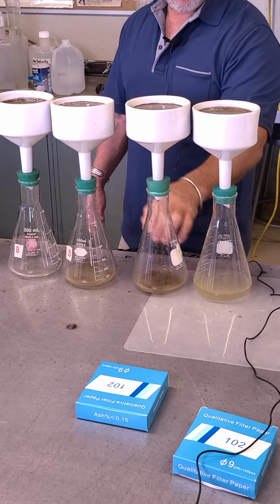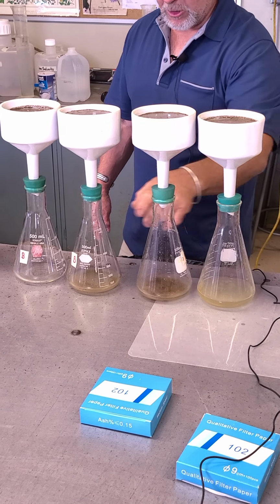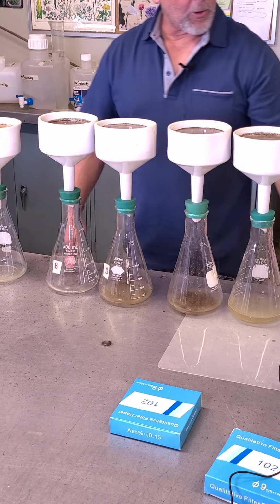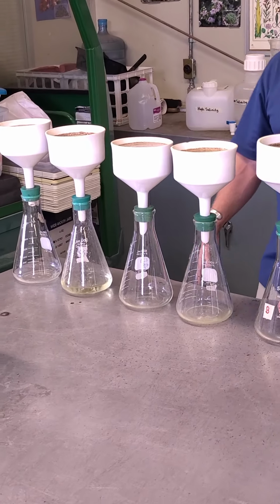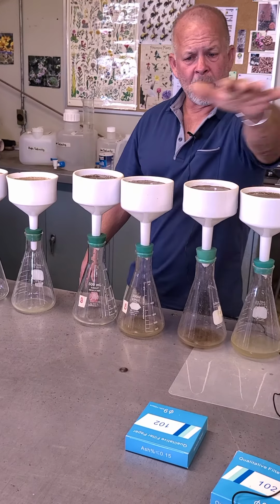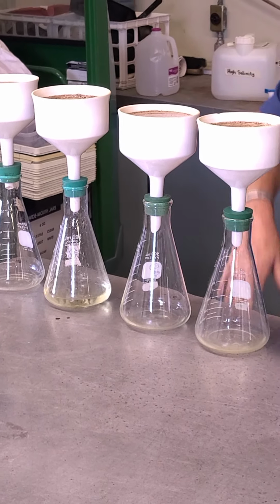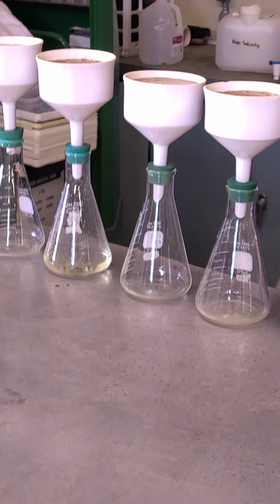Over here, on this one here, it looks like the deionized treatment one. I see a little bit of movement that's still dripping, and I see not much else. There's a little bit of dripping there. It looks like number 4, which would be the saline sodic, it's still doing something. And then over here, actually I'm sorry, that's the loamy sand. The first one was the loam. This is the loamy sand here. And then you can see on this one, I'm getting a little bit of dripping going on all of them still, but nothing is really going very quickly. But still a little bit of dripping going on the silty clay loam on all of them.